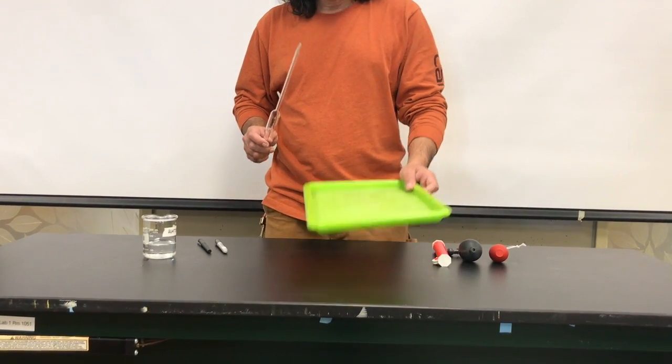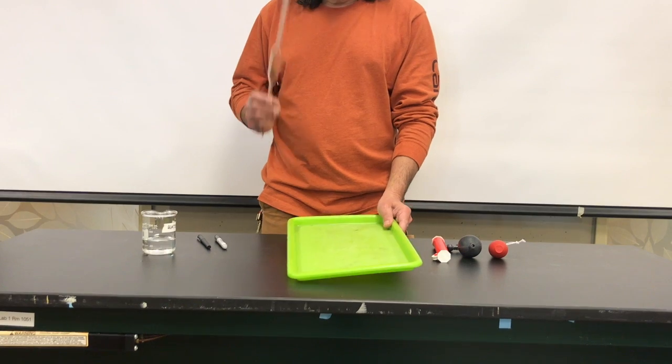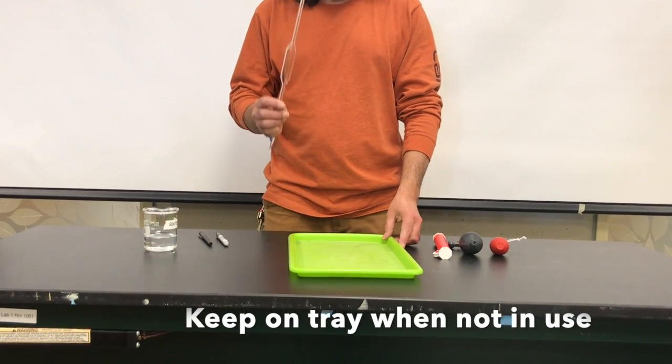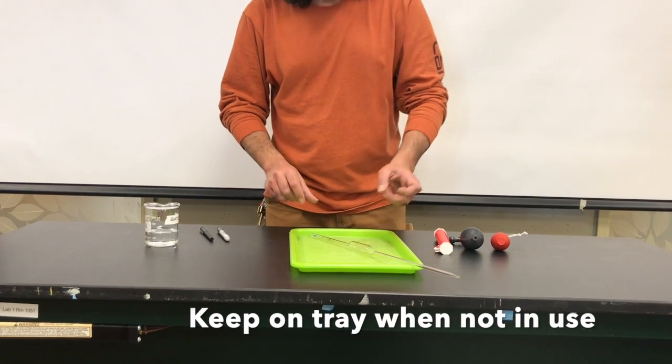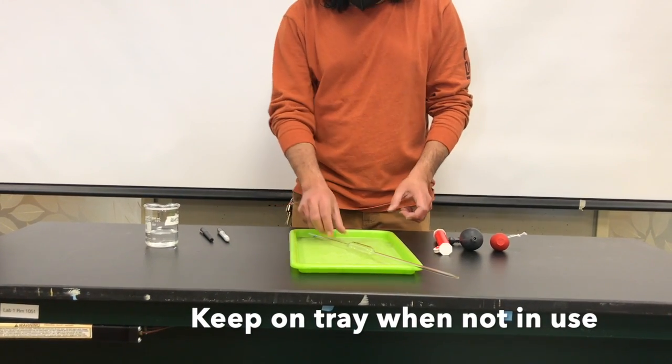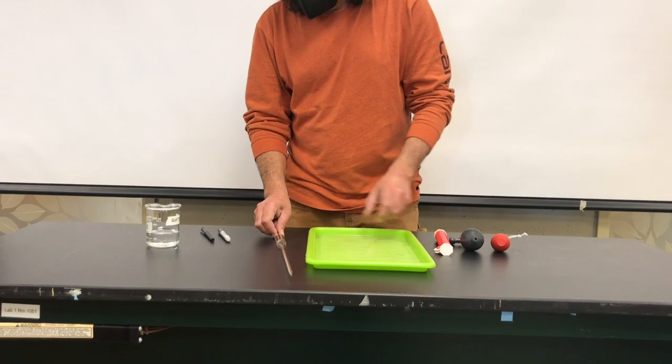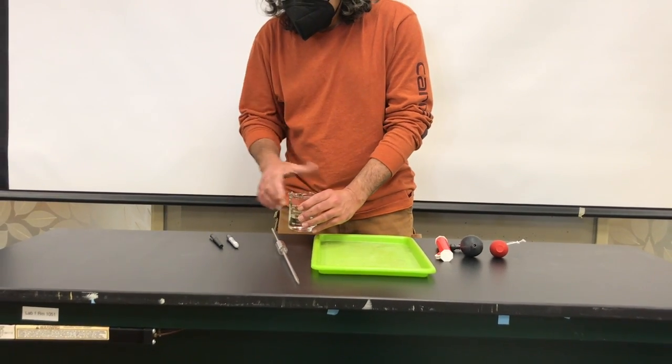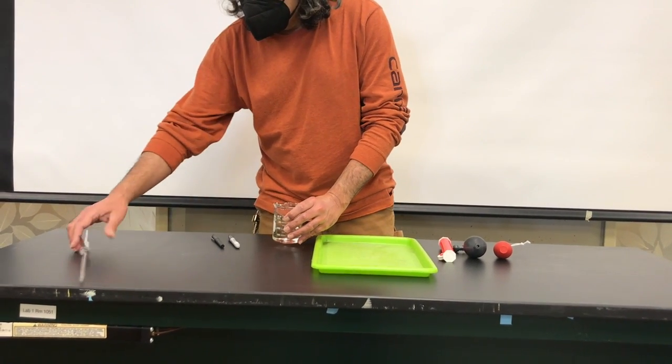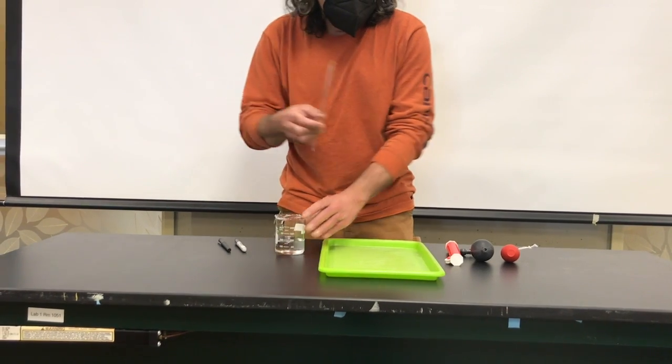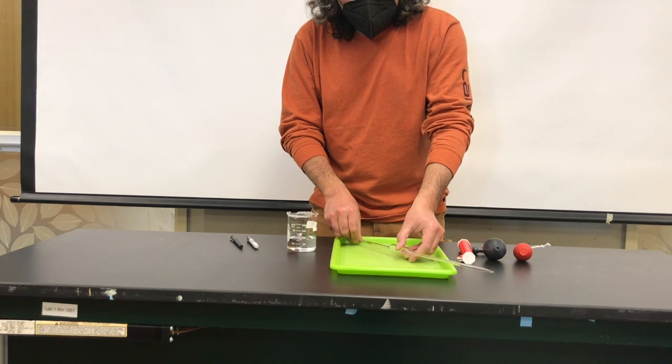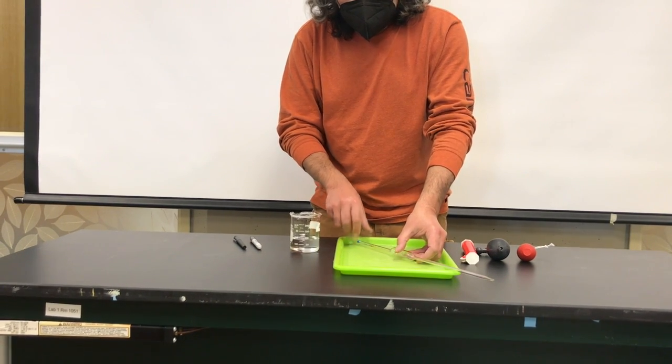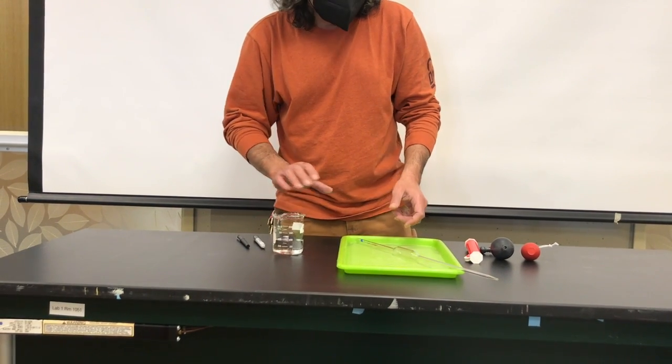We're going to give you trays so that when you're working with volumetric pipettes, we want you to always keep the pipettes on the trays. The reason for that is that these actually can roll off a table really easily and if they fall, obviously they will break. So try to remember to always keep the volumetric pipettes on the trays because they're really expensive.